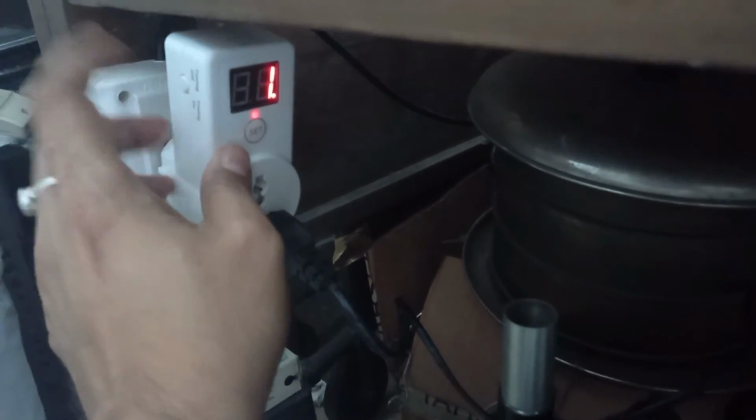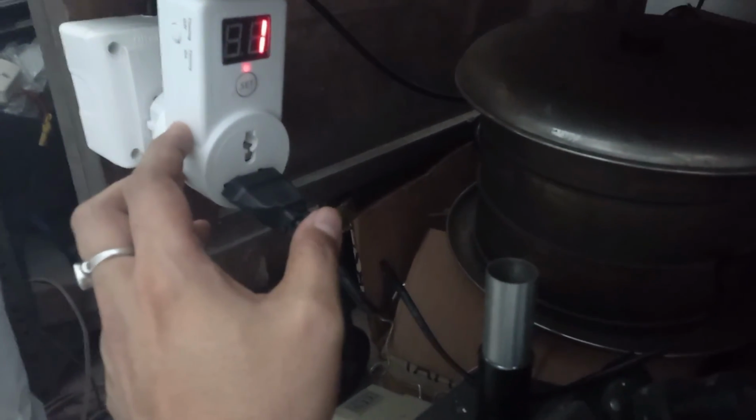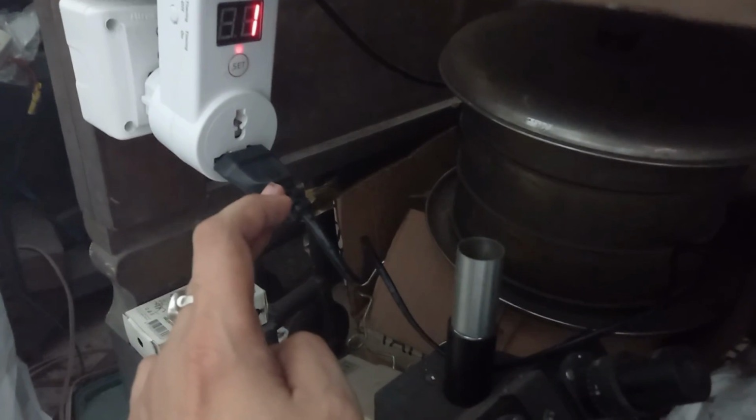Now regarding this, you can use one small gadget. This is a timer actually, a time-off switch. This is very easily available on Amazon. You can purchase this. It is connected to the main line socket, and this is the timer, and this is the main plug of the UV cabinet.